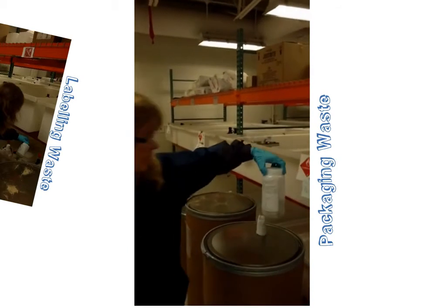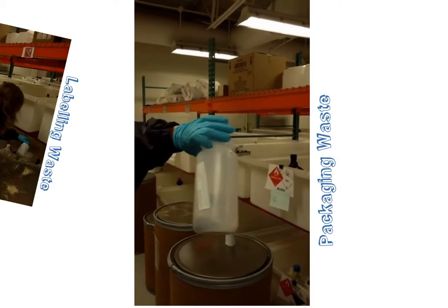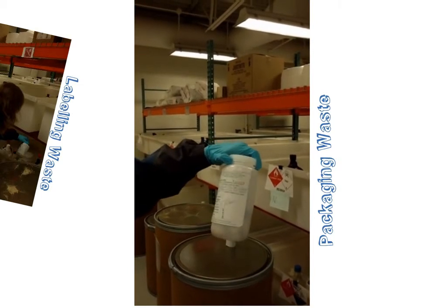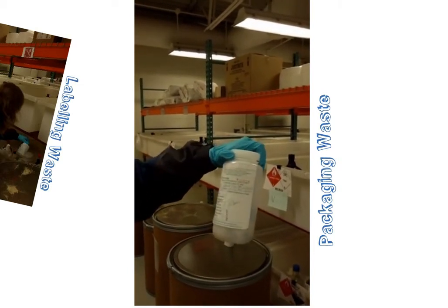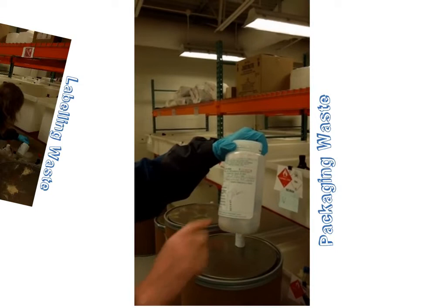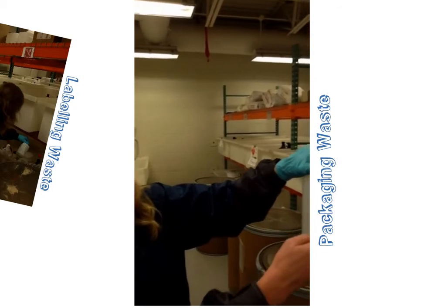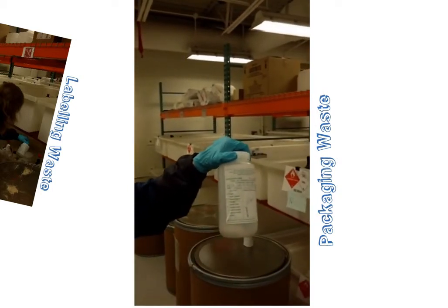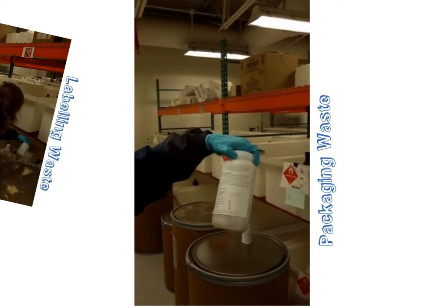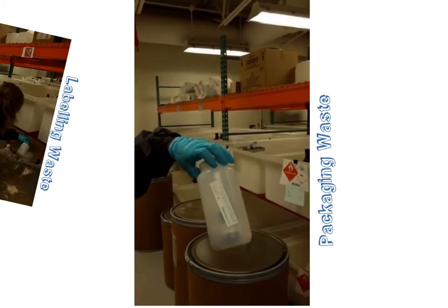Here is a container that came from chemistry. It's got some student preps that we're trying to get rid of. We have to group these. The labeling is typically not very good on them. So the safety manager, Kian Leach, in chemistry, has put one of the hazardous waste labels on them and given us the group of the chemicals that they fall into. She's also told us by checking off one of the categories on the left what those are. So in here we have some ketones, they're dried, and this is the label that we can use because student preps are not appropriately labeled for waste disposal.